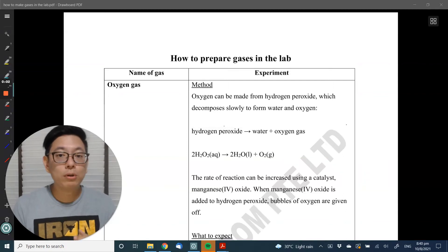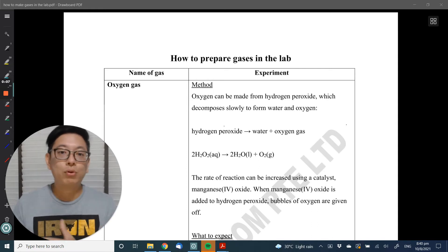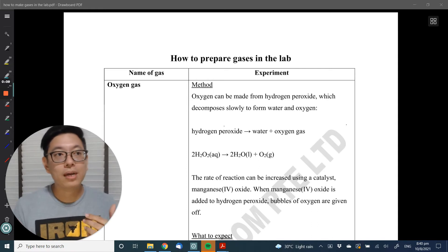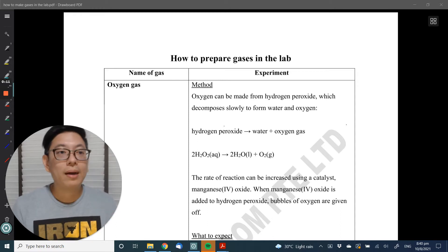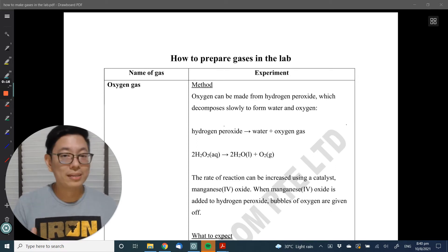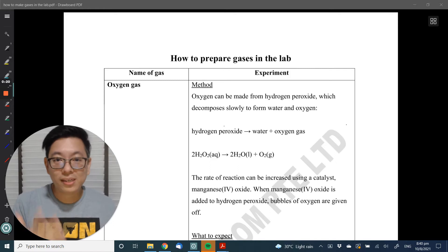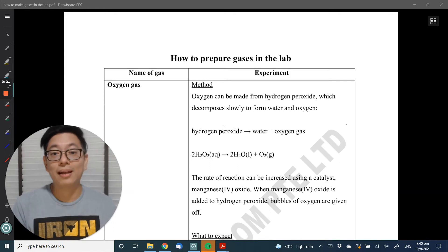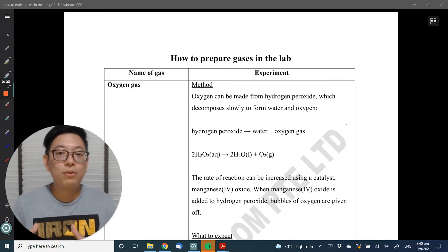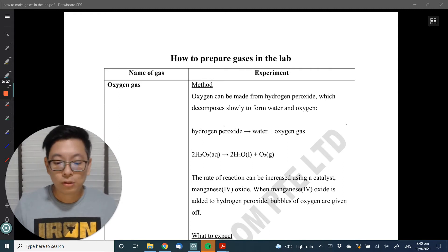What I'm going to do in this video is show you how to make gases in the lab. The reason I want to do this is so that the next time you go to the chem lab and start your QA experiment, you'll know what gas you are testing for and what gases to expect. In our syllabus, there are only about five or six gases that are tested, so knowing how to make all of them gives you a one-up.